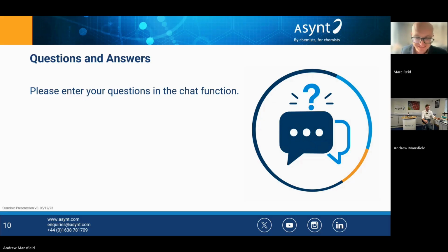There's a lot to unpack in there. There's about 4 or 5 questions, all of which are really legit and excellent. So let me try my best to unpack, and we'll revisit the later ones should I forget them. So delta E is a single point measurement, first of all. That's not strictly true, but understandable based on what I presented.